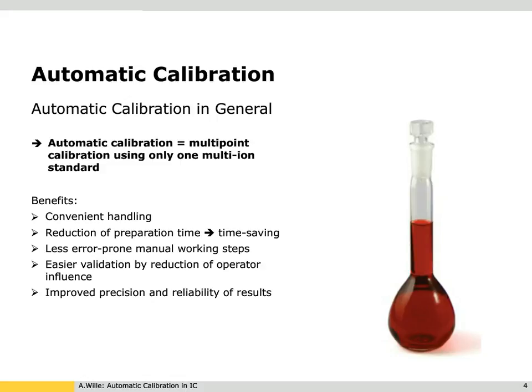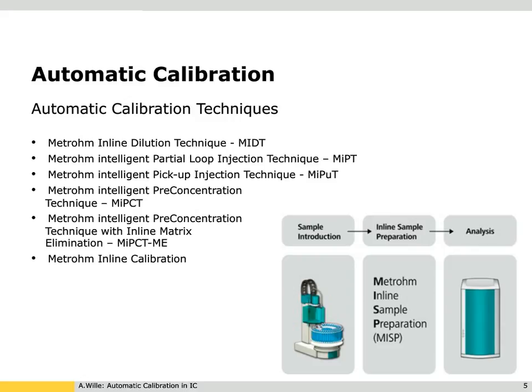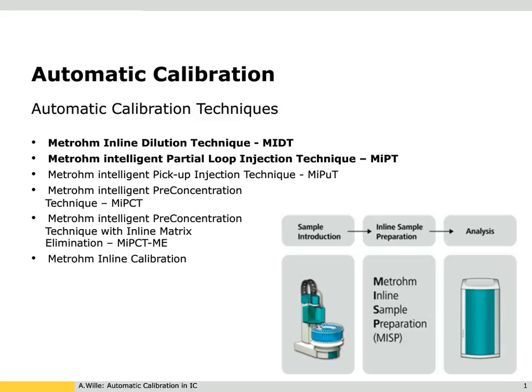For automatic calibration, we know different techniques which we can use. Starting with inline dilution techniques that I will show today, as well as the Metrohm Intelligent Metrohm intelligent loop technique, two techniques which are usually used in the environmental field. These two I will show today.